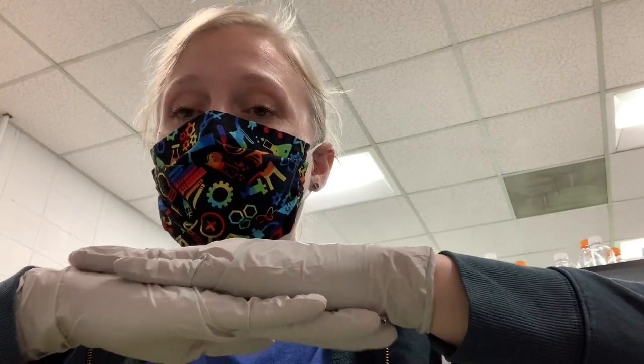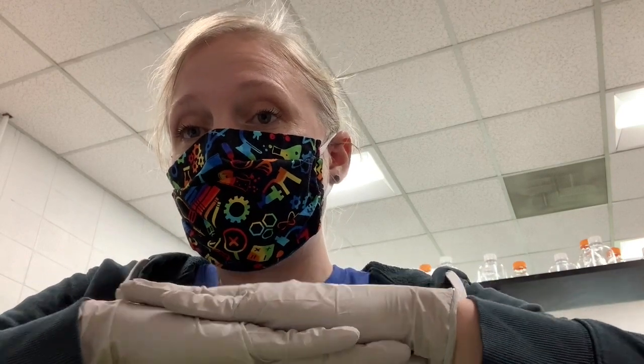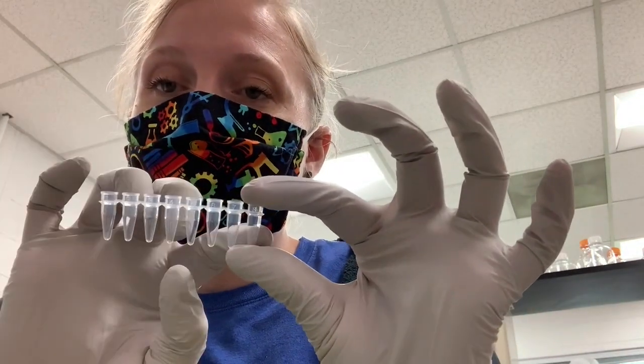And then by slowly lowering the temperature, you will encourage pairs of RNA to bind together specifically, so you'll truly have double-stranded RNA. This can be done more than one way. So some people like to resuspend their pellets, spin them down, and move them into PCR tubes. You need to label them really well if you're going to do this. You could then take your reactions, cap them, and put them in the PCR machine, where there's a program that will take your samples through these different temperatures for the indicated time.